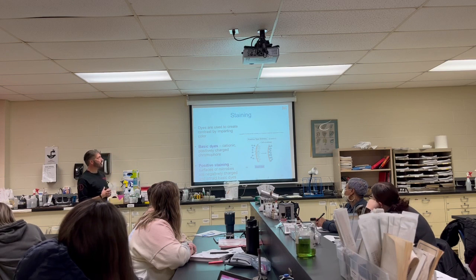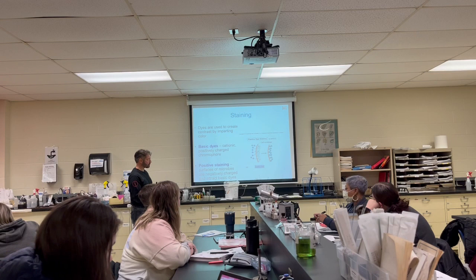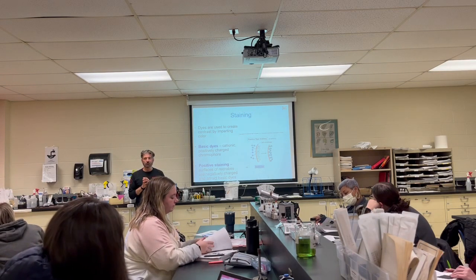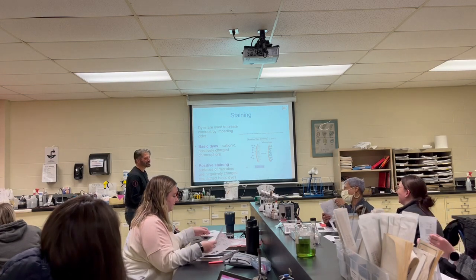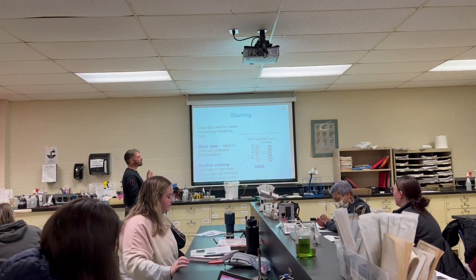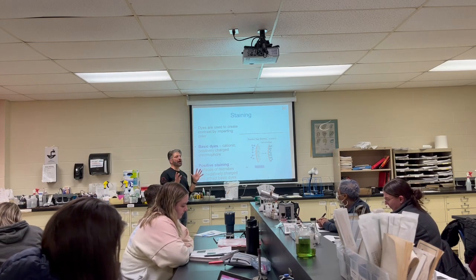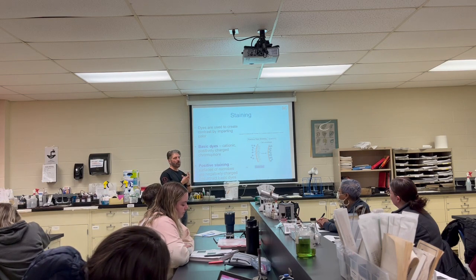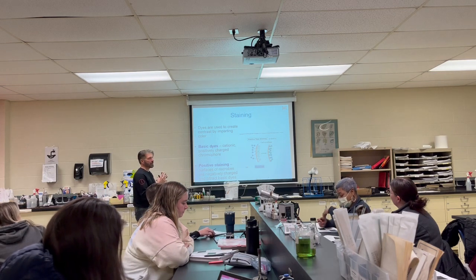So with staining, dyes are used to create contrast by imparting color. Everyone loves chemistry in here? No? Just basic chemistry. We're just going to use the premise that positive and negative attract. Anything with the same charge should basically repel, and anything with opposite charges should come together.